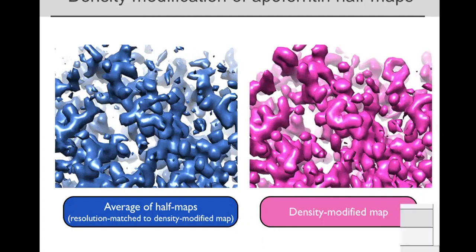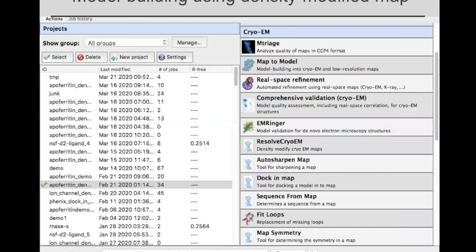So we're going to go to the map symmetry tool, and we're going to use that to find the symmetry. Basically, we're just going to put in the map. We're going to put in that we want to find the symmetry, and it'll find it for us. This works great if the symmetry is something simple. It's any popular symmetry, and if the symmetry elements are along cell axes, this works terrific. If you have symmetry that's not along cell axes, then you can also find it with map symmetry, but it doesn't always work, and it takes a really long time.